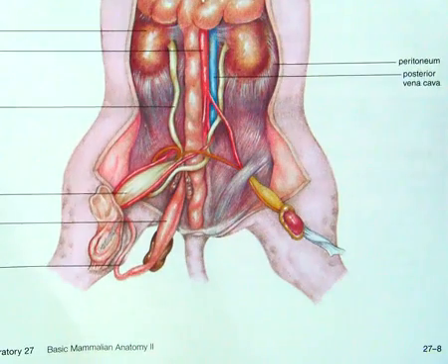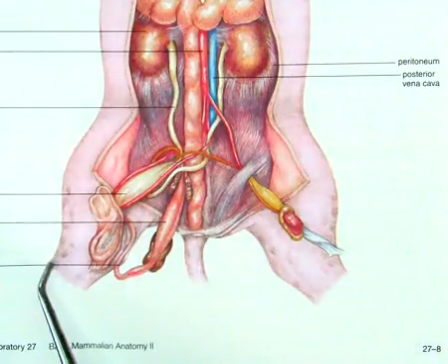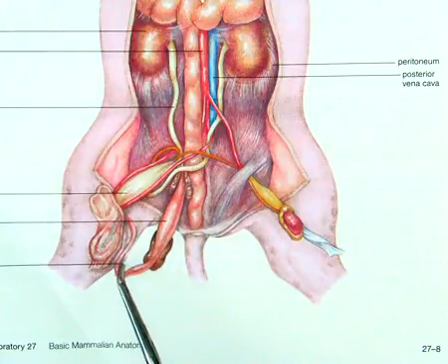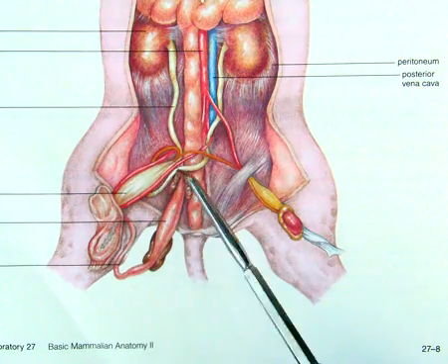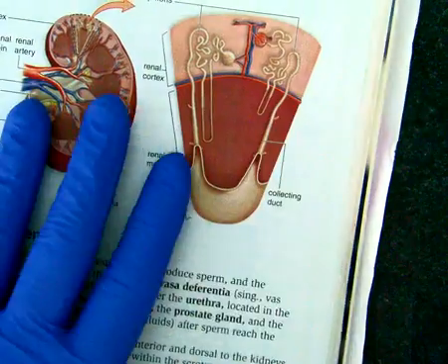Now in the male, we should also be able to find the penis, and we did find that pretty easily, leading right away from that bladder. And we'll be able to track some of the male parts. But he also has kidneys and ureters, coming down to the bladder, joining to the bladder. And then we'll have the additional penis here.